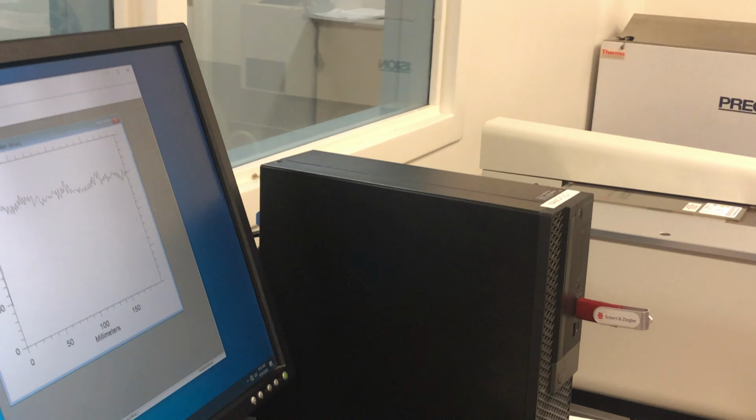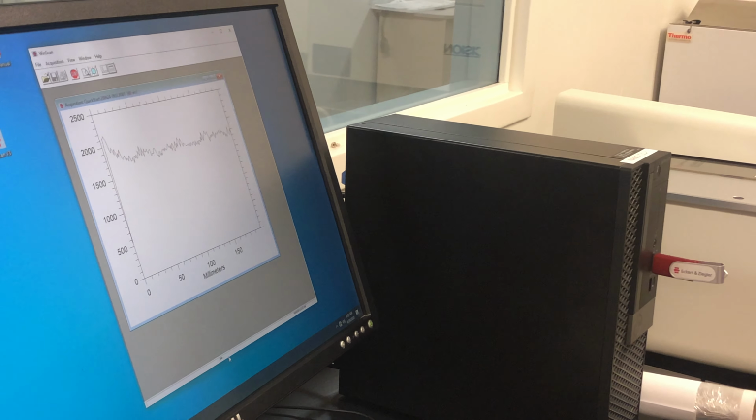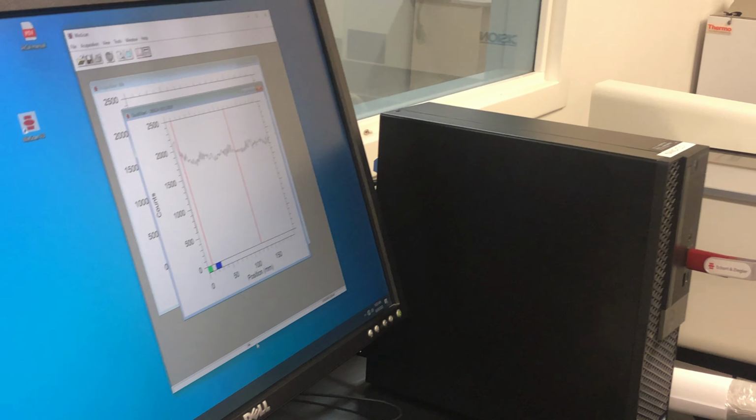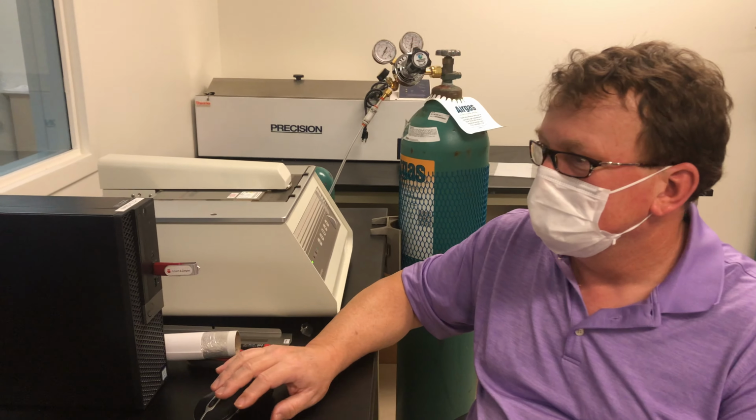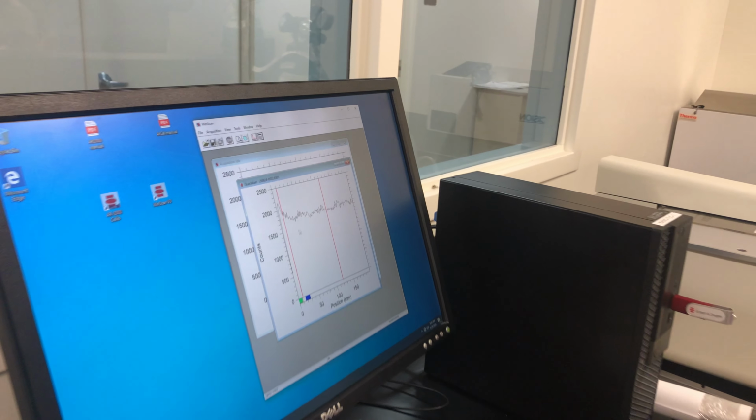Collecting 53 of 60 seconds. When it's done, it'll say idle right here. It also makes a little sound. You can hear there's a valve in there that turns the gas on and off. So now it said it's idle, and it brought up these things.